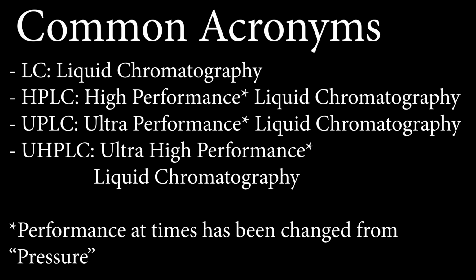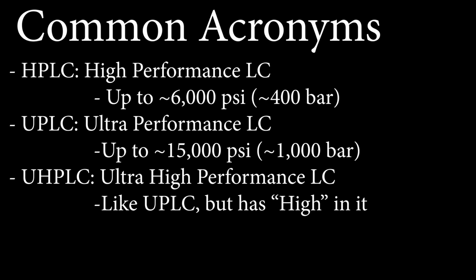The real trick here is that one of the most important logistical aspects of an LC experiment is that you're going to use a pump. You're going to push the solvent, the mobile phase, over the stationary phase. And to do that, you have to apply pressure. And it turns out, as you'll see, you can get higher performance if you're using higher pressure because you can use smaller particles. But that is to say, you have to have a fancier, more expensive instrument to go to higher and higher pressures. So what has happened is people have built equipment that can go to higher and higher pressures.